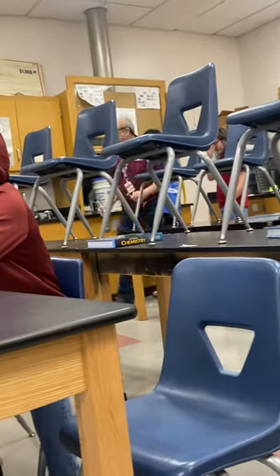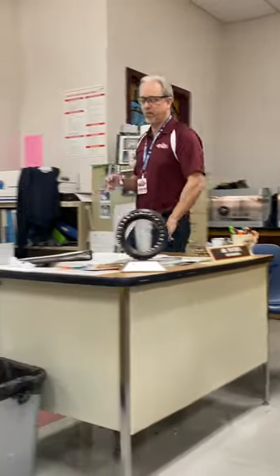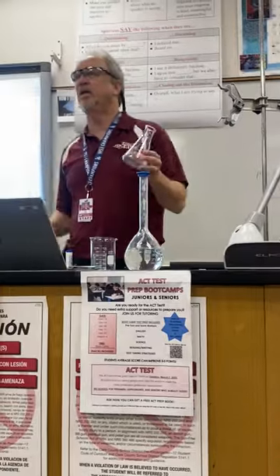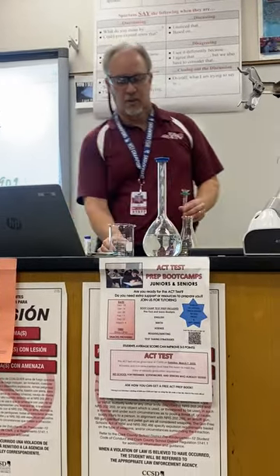So I'm going to give you a sample. Every year I get at least one student that dumps their entire sample in and titrates, and they don't have any left over for any more trials. So be smart about it.